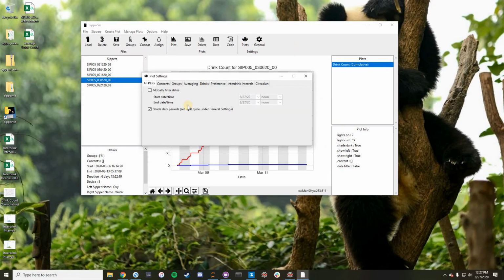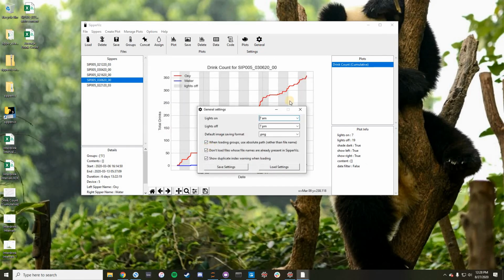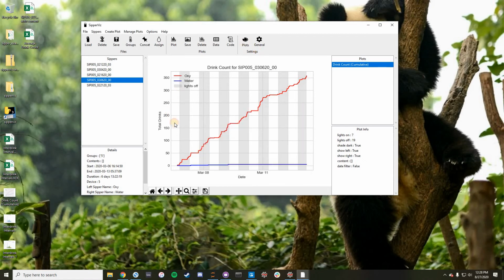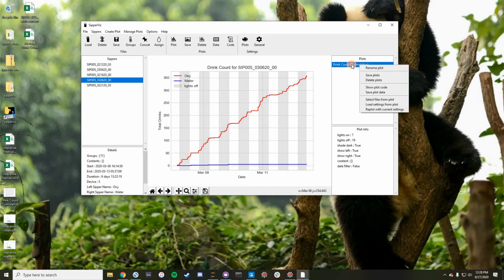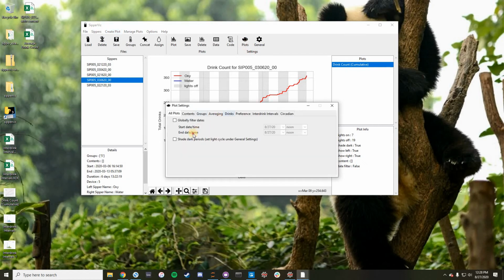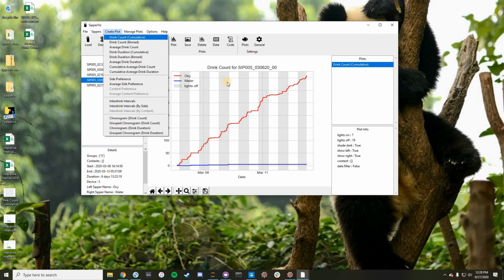So let's say I go into here and I uncheck these and stuff, and I'm going to say I don't want to shade the dark period anymore. So I'm going to just create the plot again.